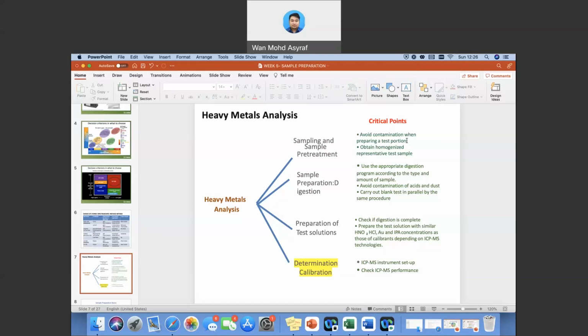For your sampling, if you are taking a liquid sample, when you do the sampling process, you can always rinse the sample tips with 5% or 3% nitric acid to avoid cross contamination from the previous sampling process. You can soak them in the nitric acid overnight prior to your sampling process the next day.